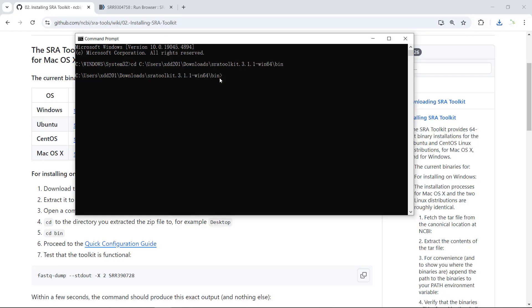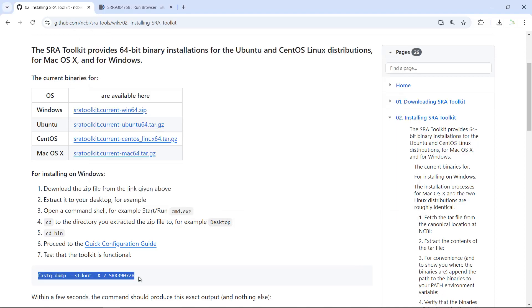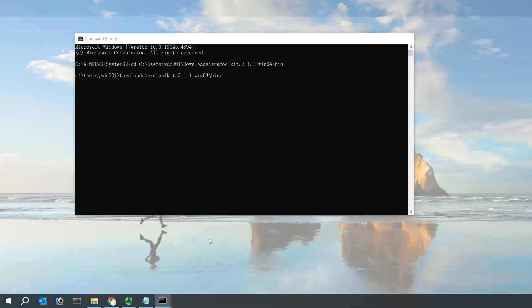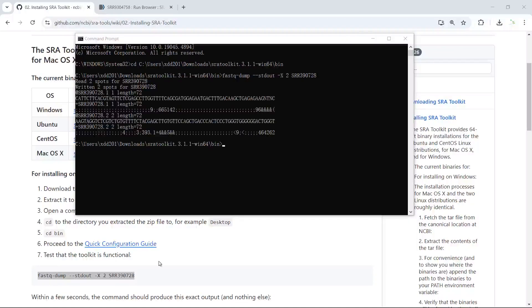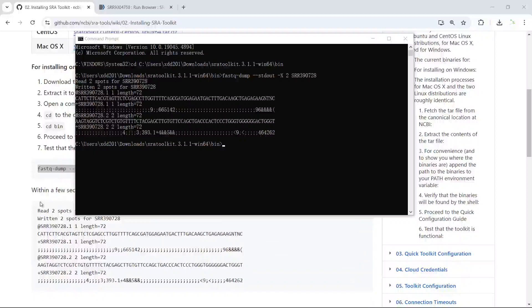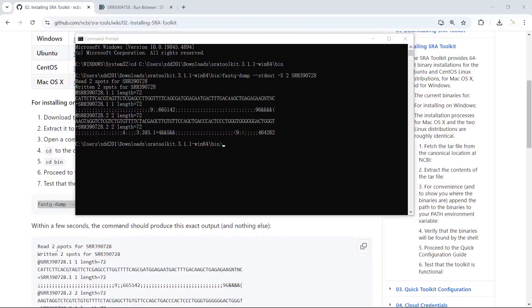Once you change your file directory to the bin folder, you can do the quick configuration and also run a test to see if the toolkit is functional on your computer. We copy the test code and run it in the command shell. You can see I got the same result as shown in the instructions, confirming the SRA toolkit is successfully installed.